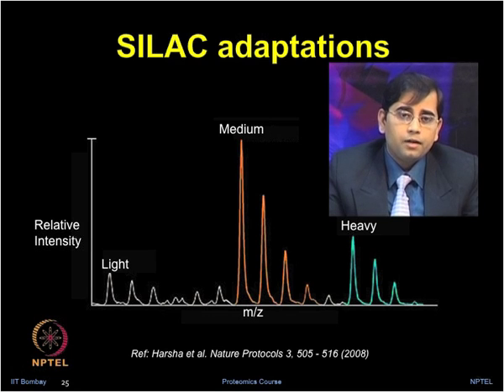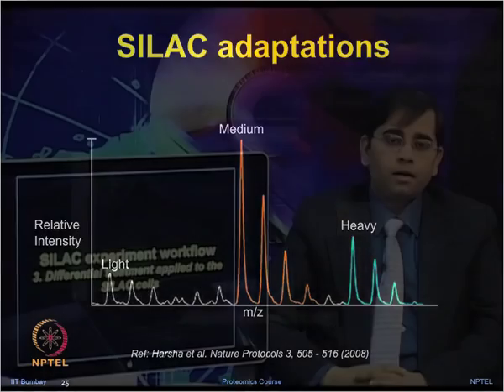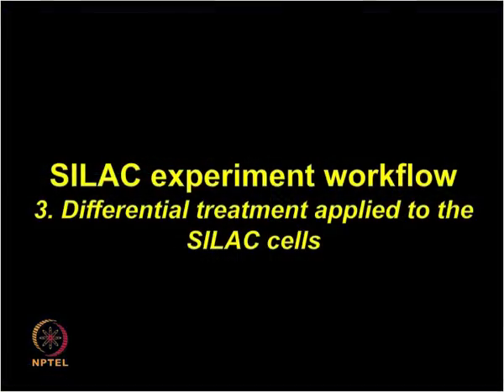These are representative spectra showing M/Z ratio and the relative intensity of light, medium and heavy forms. So, in the SILAC experimental workflow, let us discuss the third point, the differential treatment application to the SILAC cells.